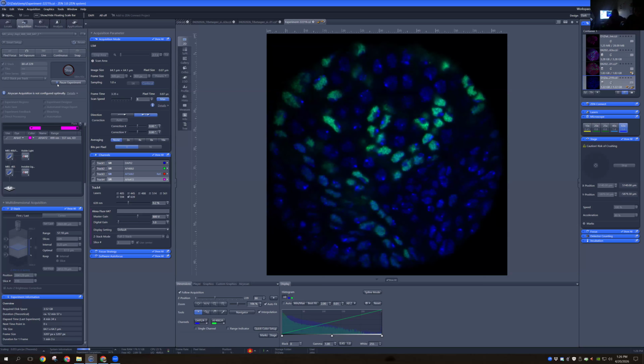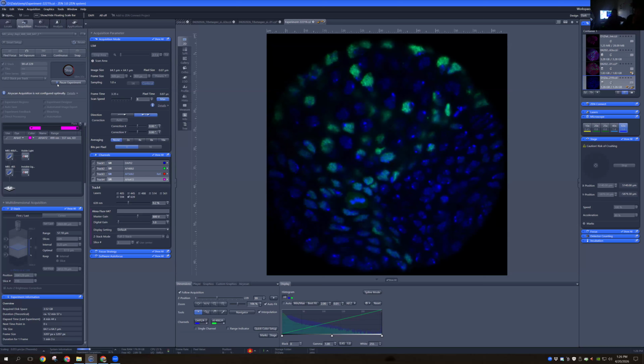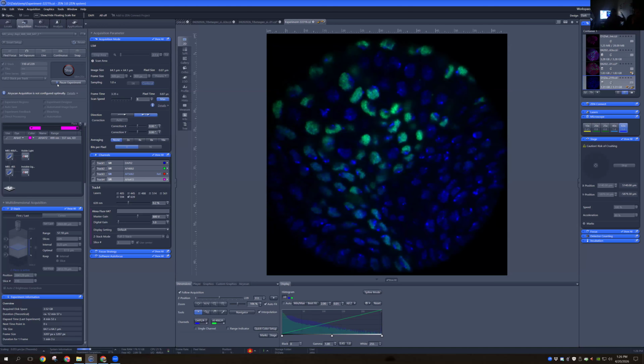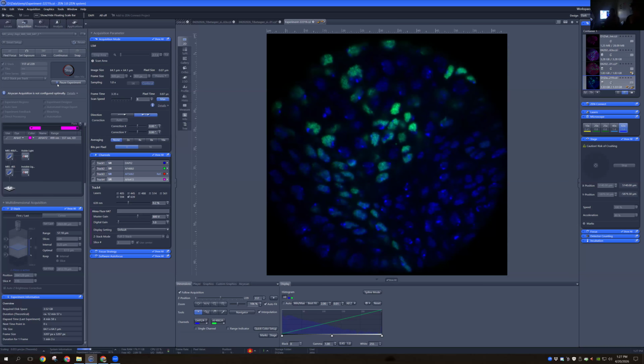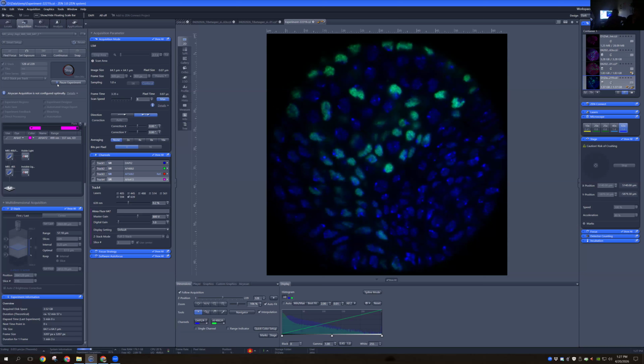Partially because there's not a massive number of people who study Drosophila ovaries in general, but the larval stage is considered very tricky to work with as well. And so I've actually gotten a lot of emails from other labs, and I've done some consulting experiments where people will send me their flies and I will dissect and image them for them and then send them the images. I've done that once, just because there's not that many people who do this.